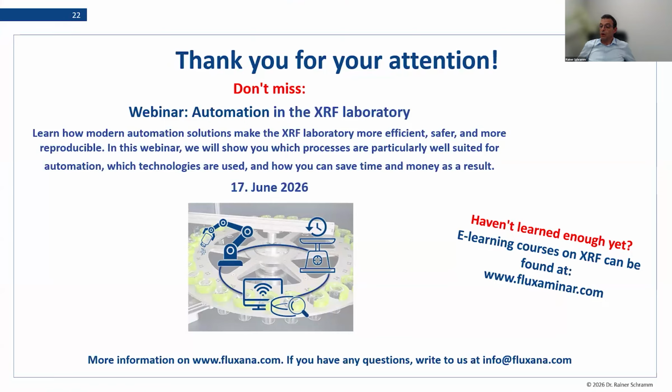Okay, there is another question. Is LOI always CO2 in XRF software?